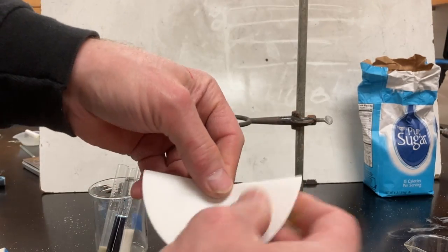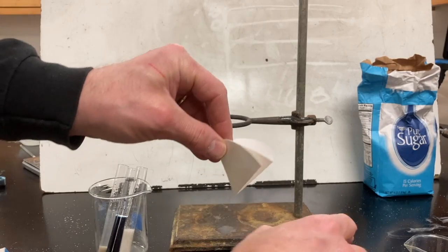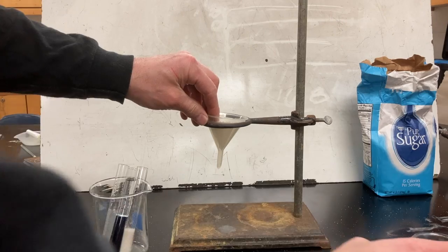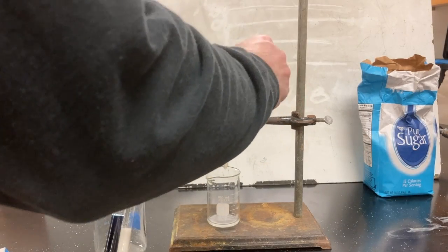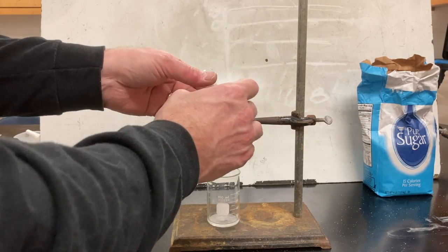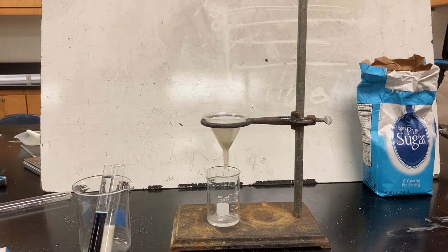They start out as round circles, and then I fold them. I'll fold it in half. I'll fold it in half again to make a cone that fits down inside the cone of the funnel. I'm going to put a beaker underneath, and then I'll take my mixture and pour it into the paper. And you can see water is dripping through the funnel into the beaker. I'm speeding it up here.